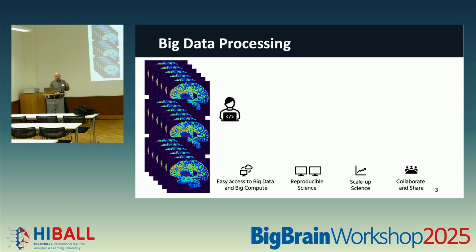At some point you're going to start small, but then you want to grow big and work with more data. You also want to understand not only the tool, but also make sure that all your workflows are reproducible so that you can come back later. You don't want to be wondering, how did I build this application, compile it? If you or a student comes back several months later, all that information is lost. So you want that reproducibility.